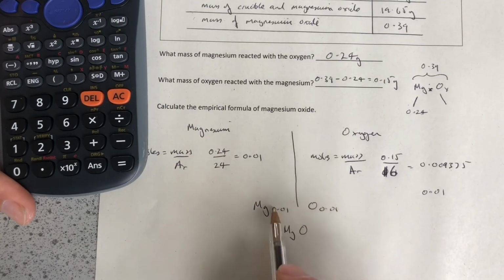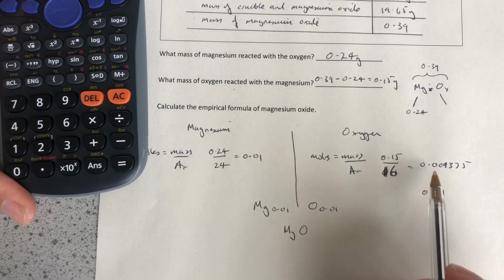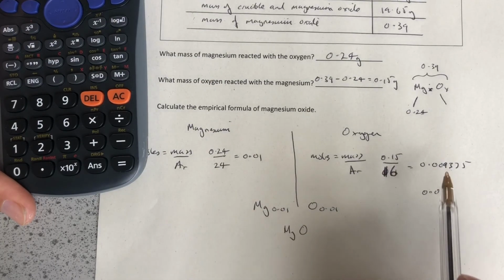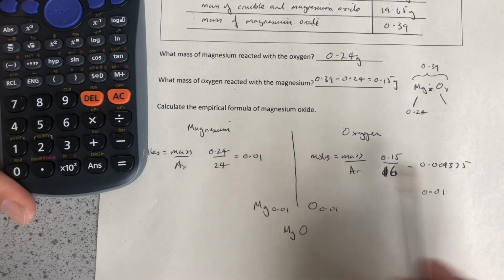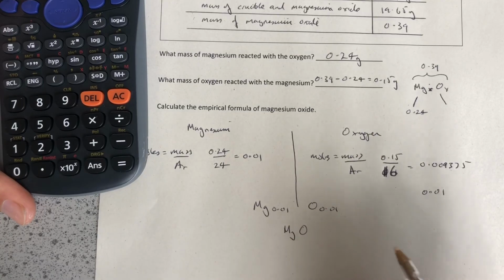Certainly when we do a practical in the lab, it's very rare for the numbers to work exactly. Sometimes rounding can help us get the right answer. Sometimes rounding gets us to the wrong answer. So we need to be a bit careful with rounding, and that's why repeating the experiment a couple of times would be good. But that's basically how we would do the experiment.